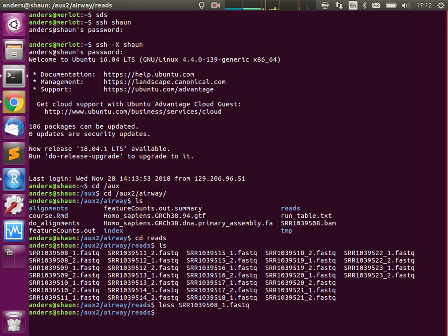What we did, as you see here, is that for each read we have 2 FastQ files coming from both ends. Then the next thing we did last time is that we made ourselves a genome reference file, because if we now want to search for each of these reads where it came from, we need to find out where it is in the genome. And for this we first need to know the genome.